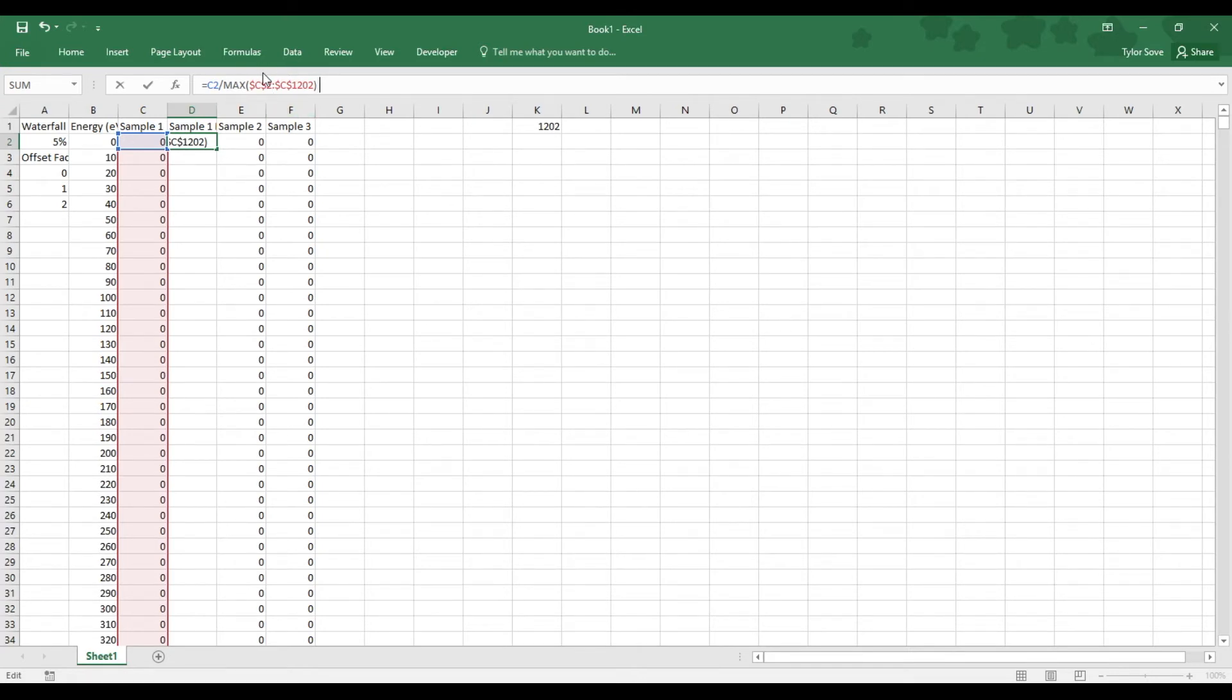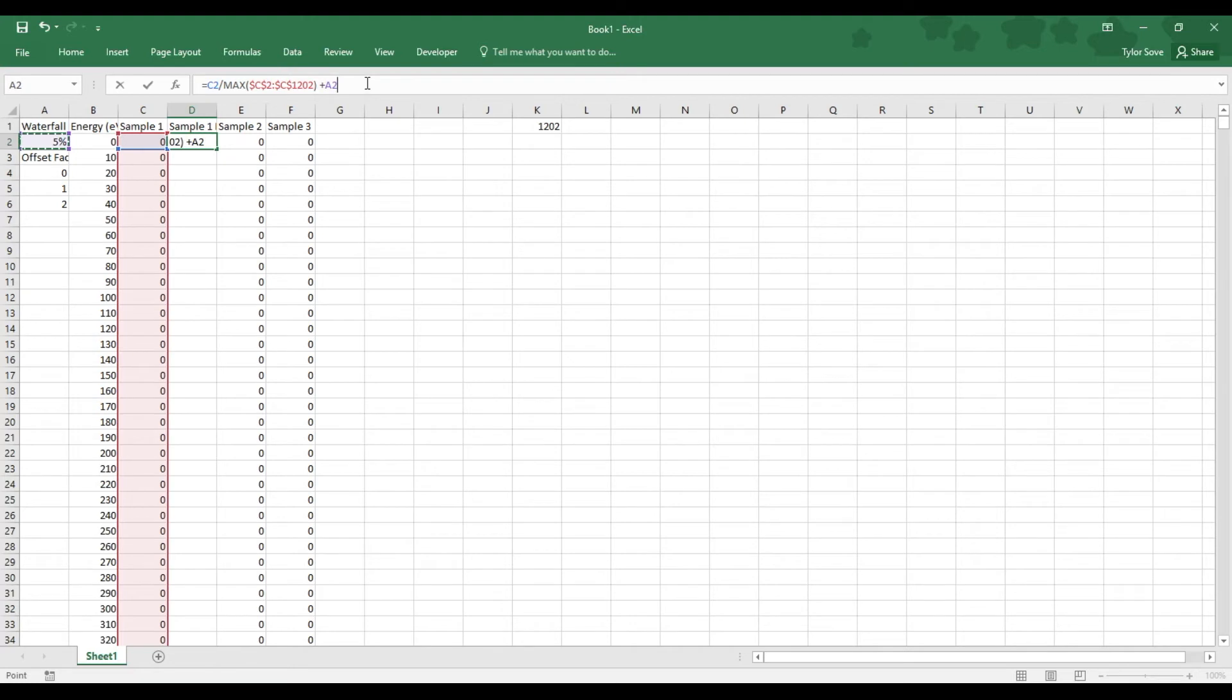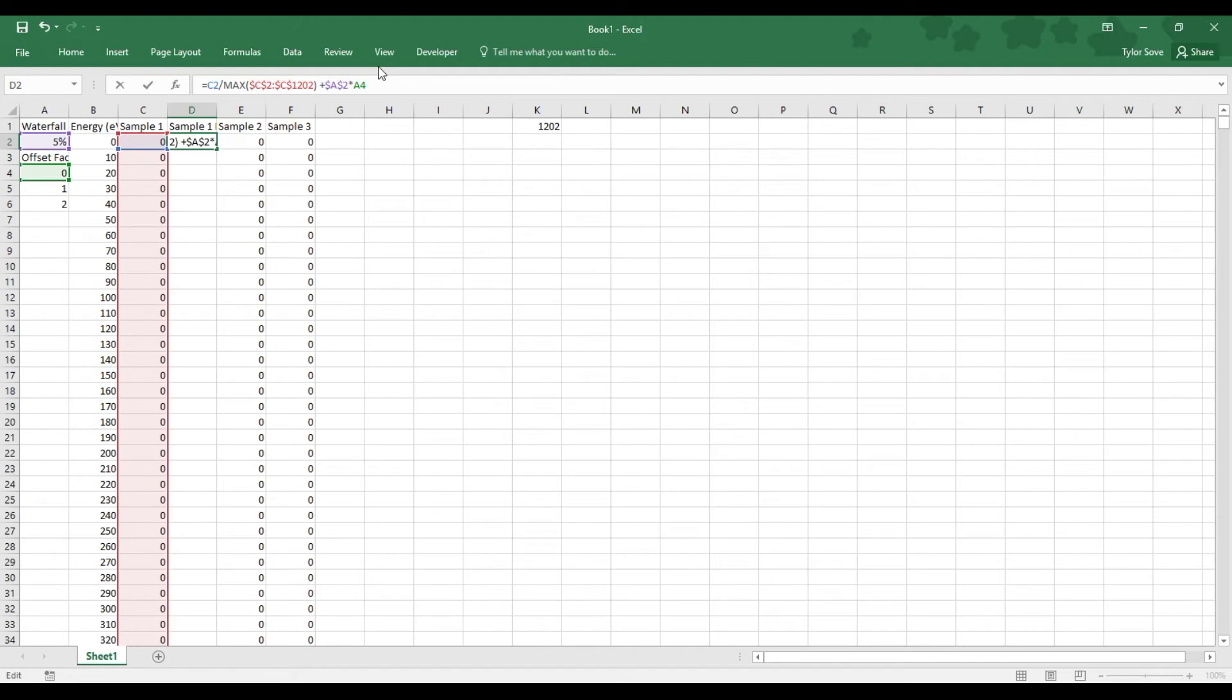I now need to add in my offset amount. I do this by adding to the normalizing this section right here. There we go. Now I want to make sure that I keep it constant the entire time, as these numbers I do not want to have changed either. This is what it should look like in terms of color coding and everything once you are done.